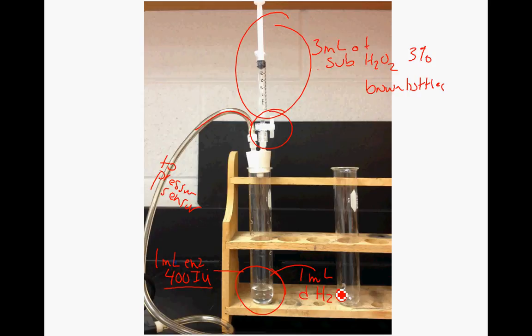Unless you are a group that's going to be varying the salt or the salinity of that solution and/or pH. Right? So instead of putting distilled water in there, you'd be putting your various salt concentrations in there, 1 milliliter of that, and/or putting in your different pH buffers in there. In both of these cases, you would then be mixing them, and I'm guessing here that 3 minutes might be enough time to mix that up and have any effect down there. All right. So there's the setup.